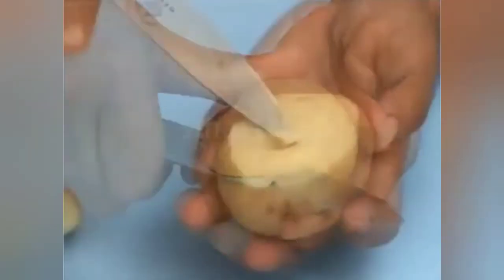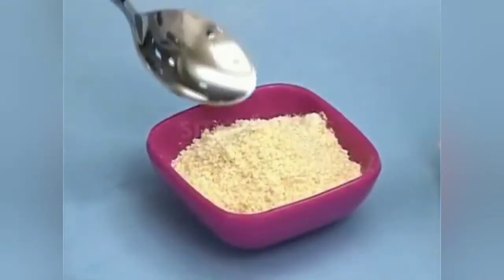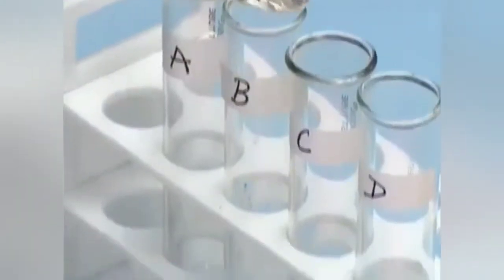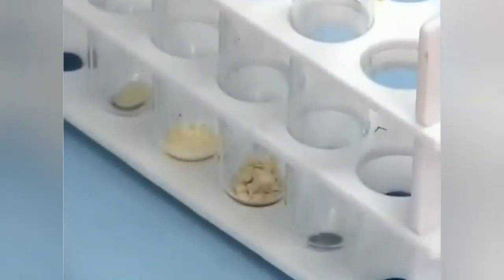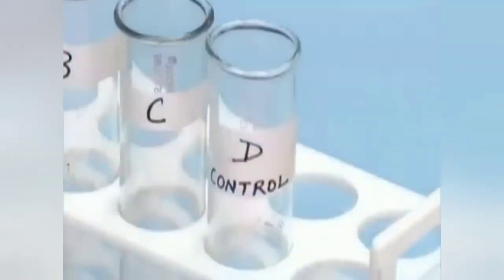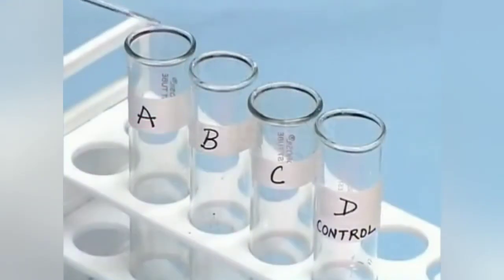Now, similar to the first experiment, put a piece of potato in test tube A, a little quantity of powdered pulses in the test tube B, and few pieces of crushed cashew nuts in test tube C. In the test tube D, add a little amount of water and label this as control. Then add few drops of water in each test tube.